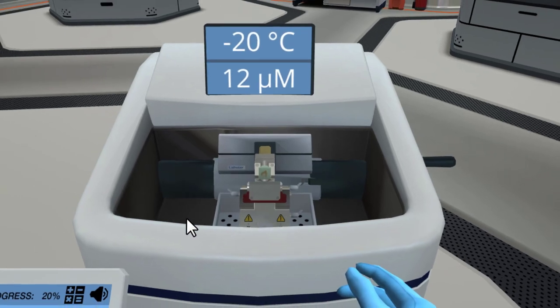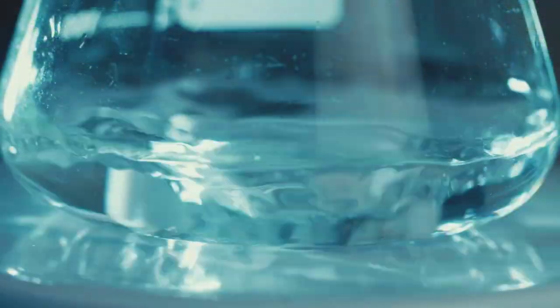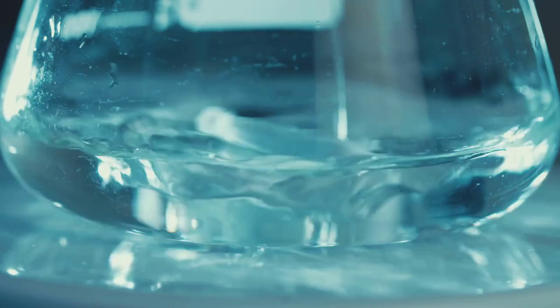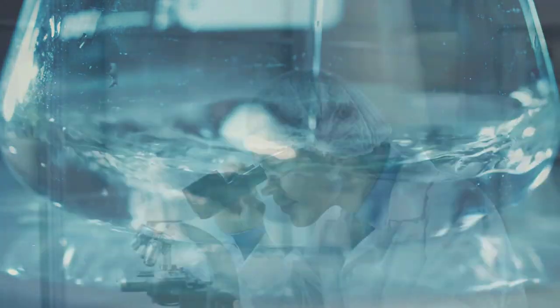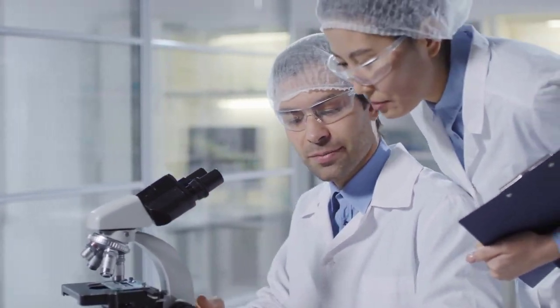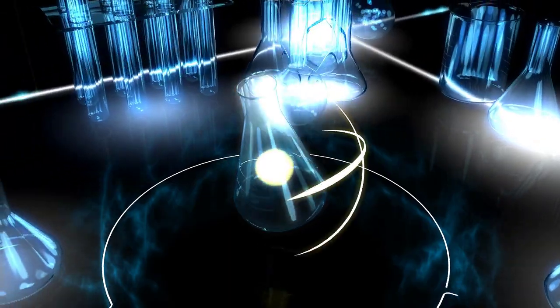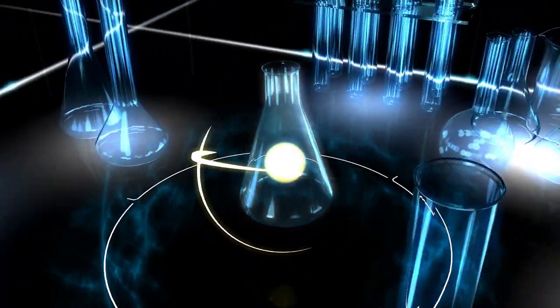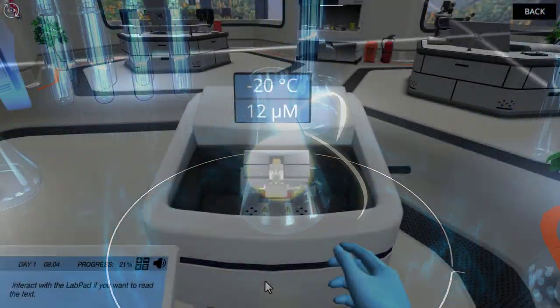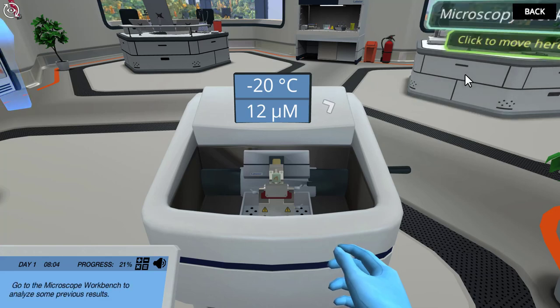We now need to use a pre-incubation solution. The 9.4-pH ATP solution will have to incubate for 15 minutes before the sample is ready to dye. During this time, let's practice how to analyze the different histochemistry assays. Go to the microscope workbench to analyze some previous results.